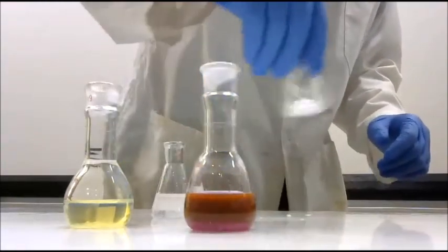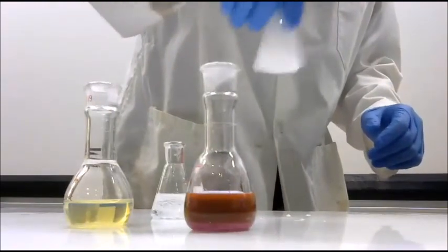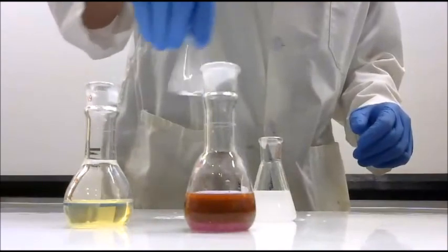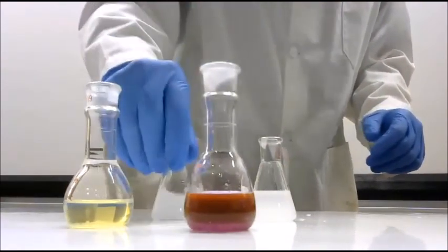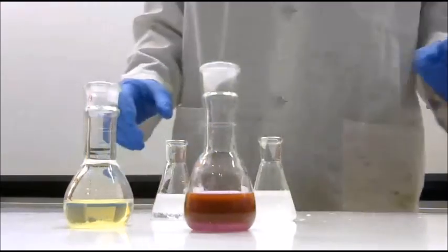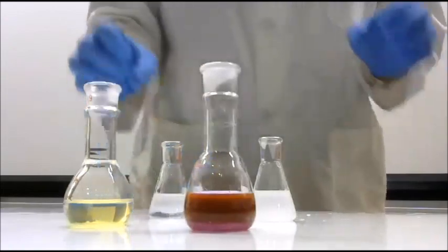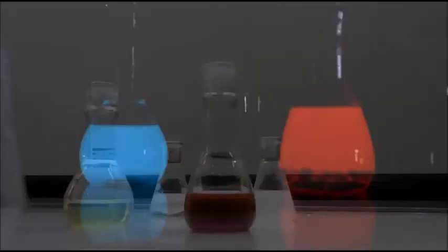We're going to suspend the hydrogen peroxide. It's not really dissolving, right? We're suspending it and making really big droplets of it, so that it will be ready to react. Now I'm going to turn off the lights so that we can see this reaction happen better.